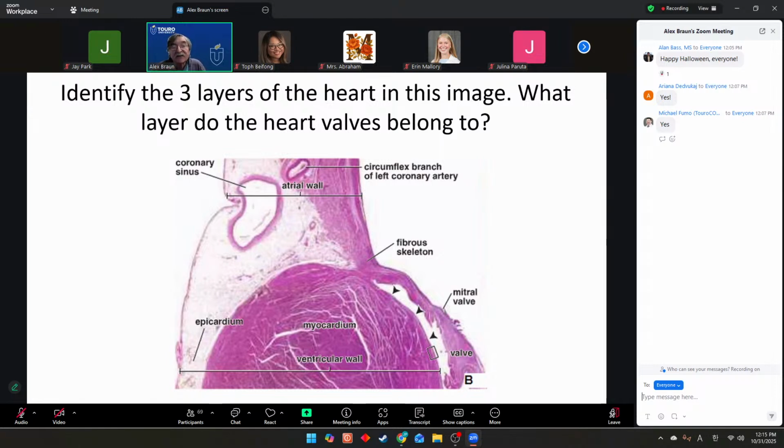There's a specialization of the endocardial layer here as well. This specialization is a flap of tissue, which is a heart valve. The heart valve is really a bit of redundant endocardium, if you want to call it that. Some of the endothelial cells of the endocardium cover the surface of the valve on both sides. There's an atrial surface here, and there's a ventricular surface to this particular mitral valve, and those surfaces are covered by endothelial cells.